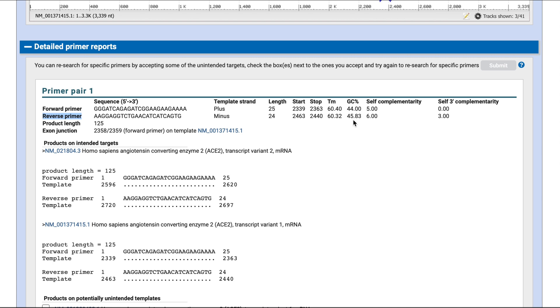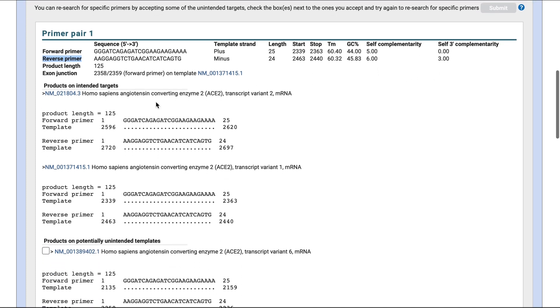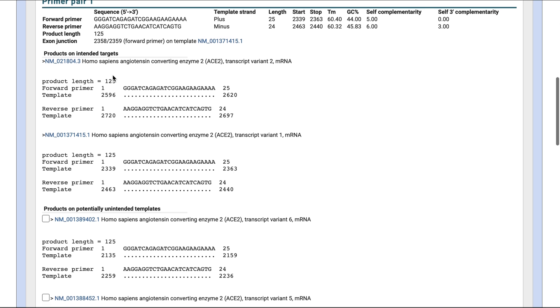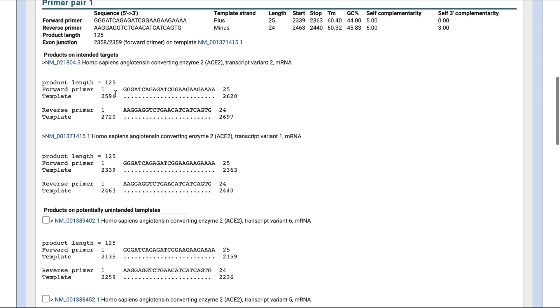Aim for a GC content of around 40 to 60% to ensure maximum product stability. Avoid self-complementarity when possible to decrease the possibility of primer dimer formation. Here it tells you the length of the product to expect and where your primers may also bind to. In this case, it's all variants of ACE2, which is fine.